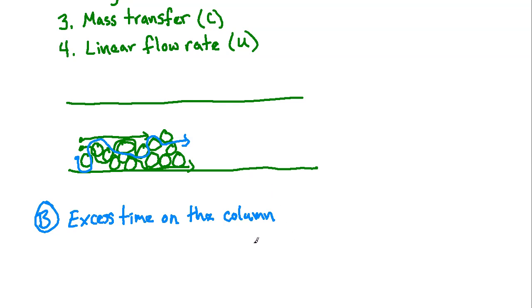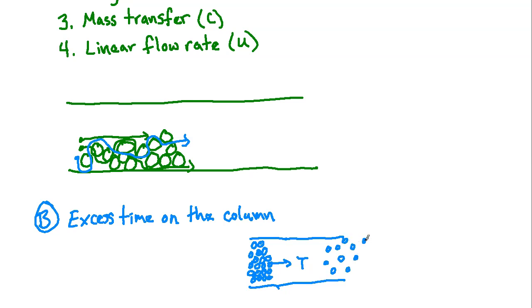So again, the idea is that, right, we've got a band of analyte. These particles are highly concentrated in one area, right? So this kind of represents our band of analyte. If each of these was an analyte particle, and here's our column, and they're moving along. Well, the more time that they spend, they're not going to want to stay all together in this area. They're naturally, after some time t, going to be more diffused and spread out from one another. Now, that doesn't mean they're spread out over the entire column, right?